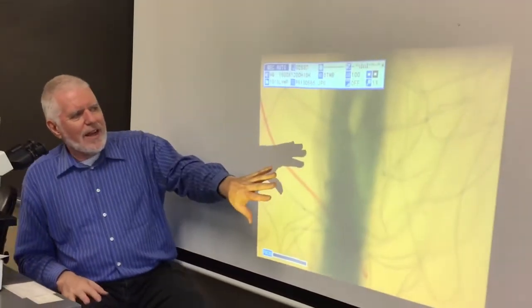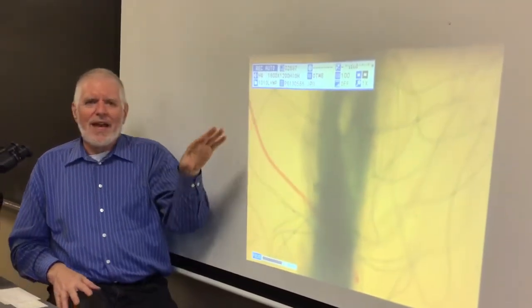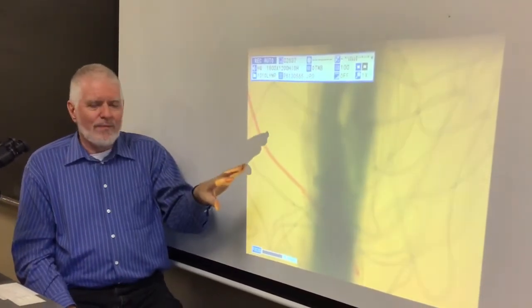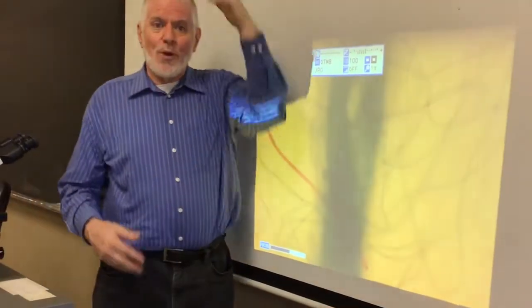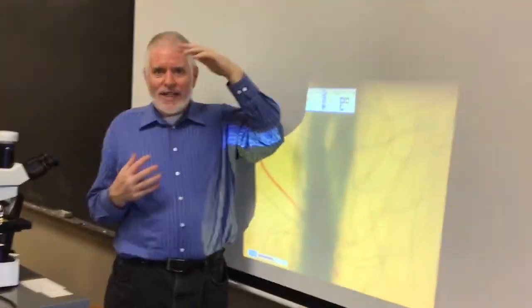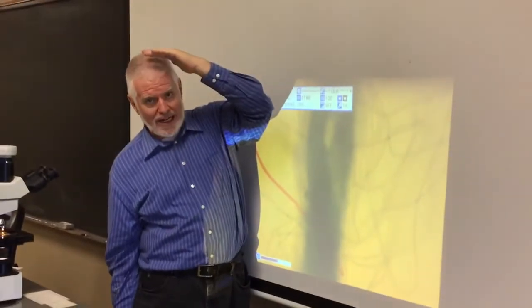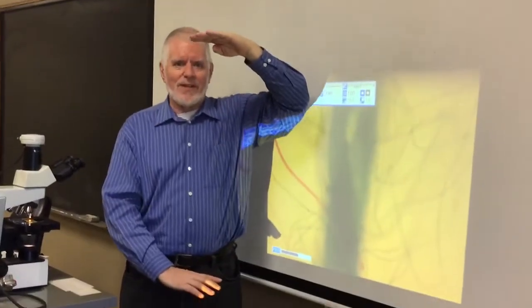Here's another thing about the way the microscopes work. At low power, there's what they call the depth of field. So if you imagine that I am a thread, when you got me in focus at low power, you could see the little bitty threads in me from the top of my head down to about my knees. About 3/4 of that thread was all in focus at once. That's the depth of field.